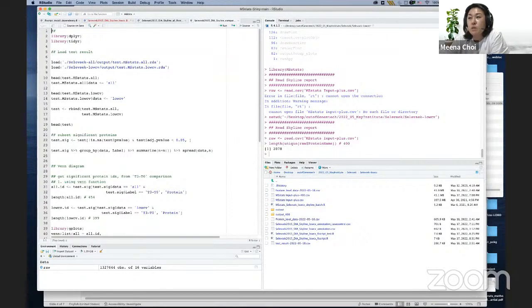Sometimes after summarization, the protein level distribution of each sample is not even. Yes, do you think that we should do another normalization at the protein level? I prefer not. For me, the goal of normalization at this step is just to remove the systematic errors, right?